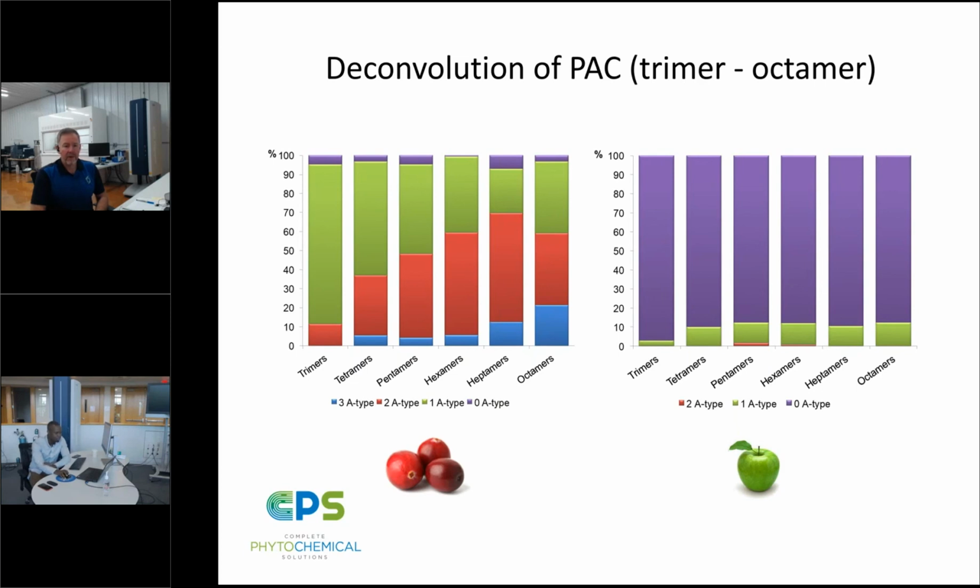Yes. If everybody recalls from Pierre's earlier presentation, the MALDI is capable of detecting in both linear and reflectron mode. The data that we looked at today and the application of the matrix algebra is uniquely suited for the reflectron, which gives us a lower mass range but higher resolution of the individual compounds. If we were to acquire the data on these same samples in the linear mode, we would increase our mass range and we would be able to detect polymers up to and in excess of 30 degrees of polymerization. There is not a theoretical limit to the size that we can detect.